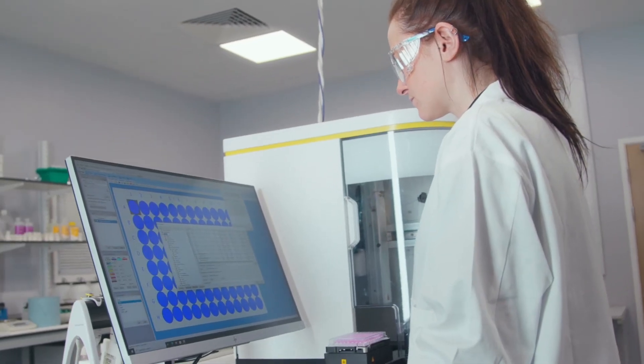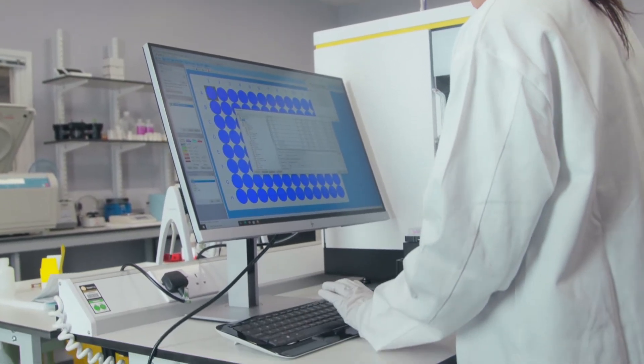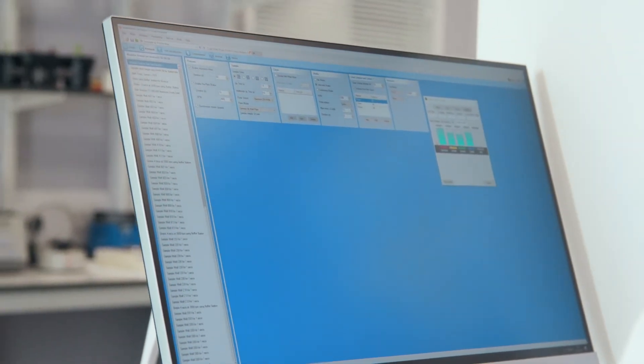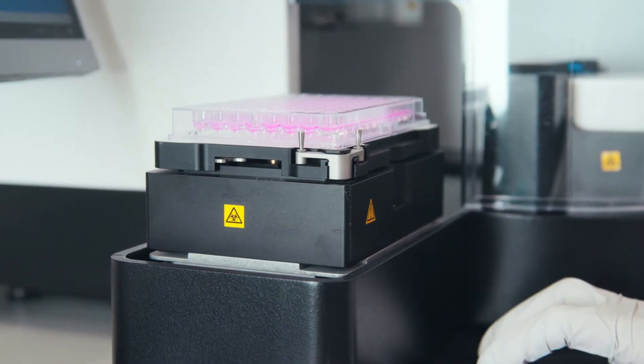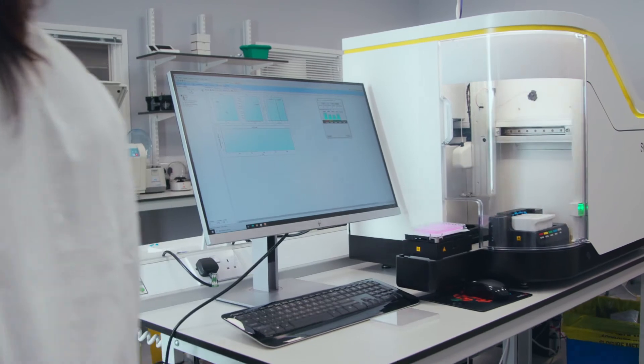Once the incubation step is finished, the data can then be acquired. The kit also includes the assay template, which is loaded up onto the IQ4Sight software. IQ4Sight is an integrated sample collection and data analysis software package, which is simple to use and allows the users to control which wells to sample, the sample volume, plate mixing, and well identification. Once loaded, the compensation, gating strategy, and other useful readouts are all imported into the software.